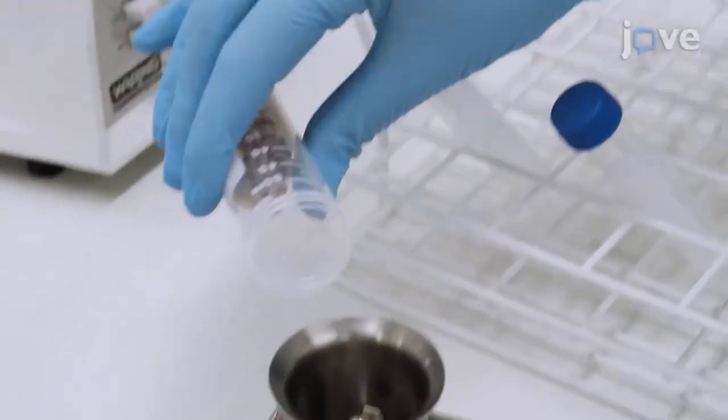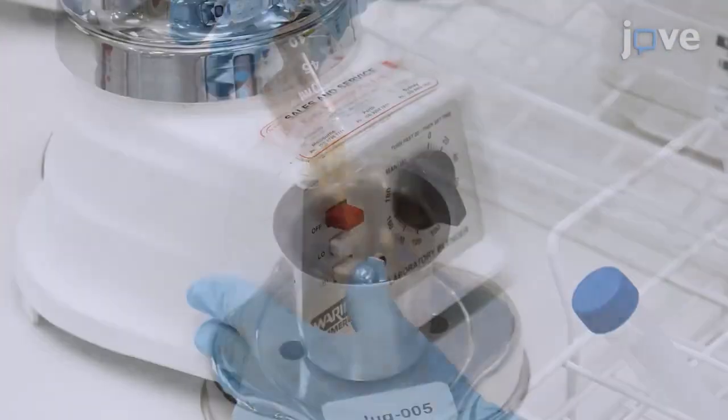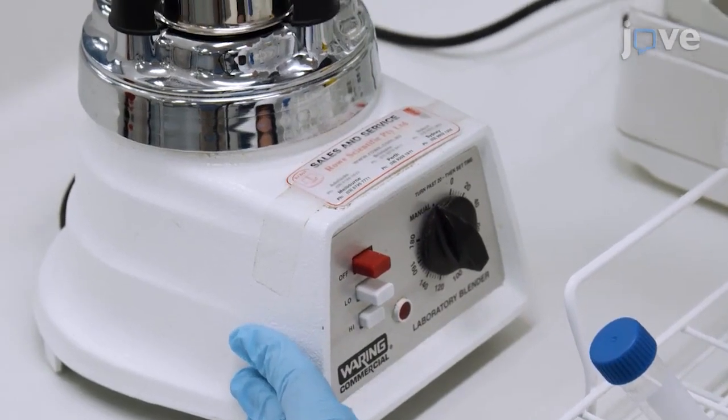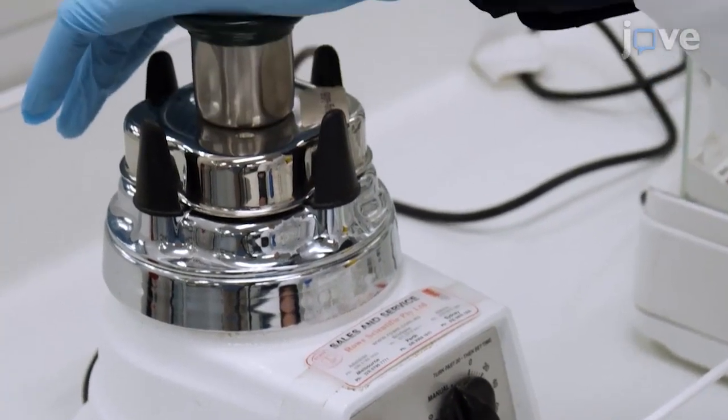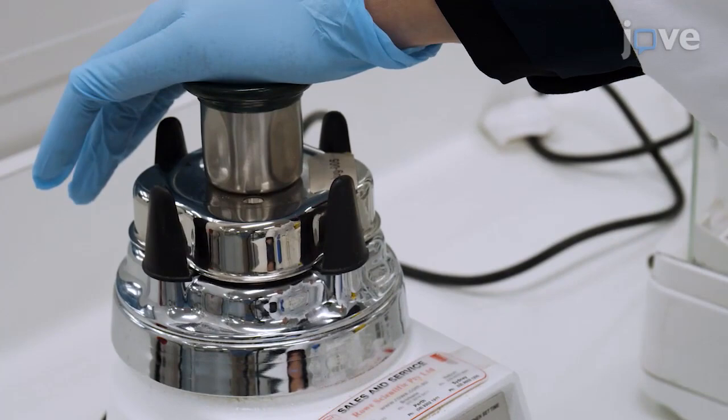To begin preparation of the grains, use a laboratory blender to grind the grain. Run the blender on high speed for 20 seconds and then repeat.